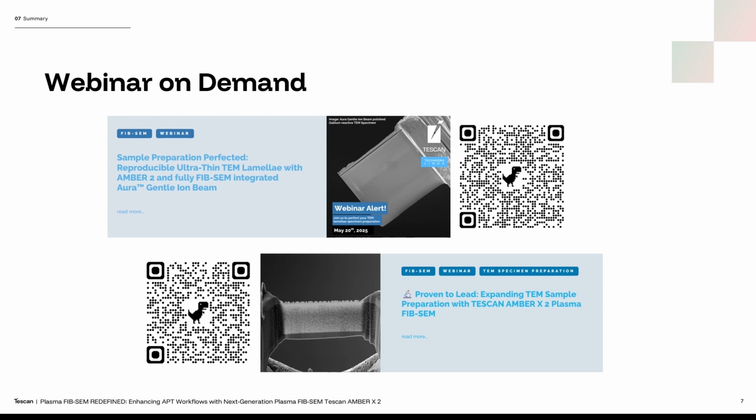It's worth mentioning that other approaches also exist to reduce gallium implantation artifacts. Just a few months ago, we hosted a webinar focused on such a solution. In collaboration with Technoorg Linda, we introduced an integrated gentle ion beam system as an alternative method for high-quality TEM sample preparation.